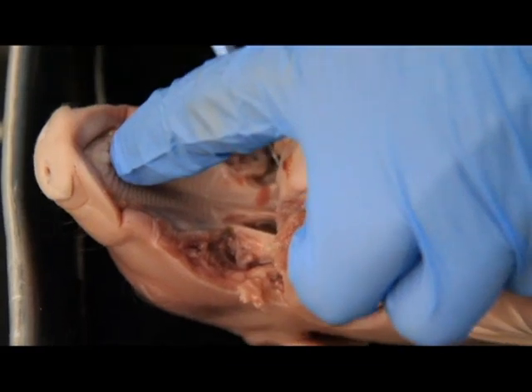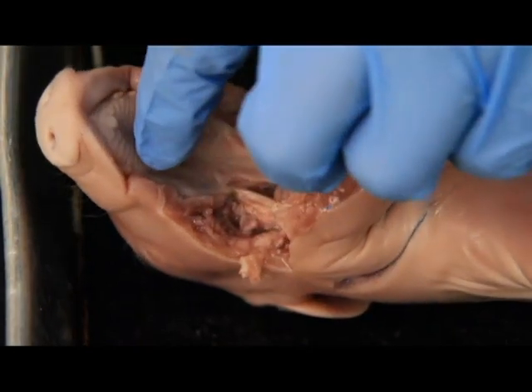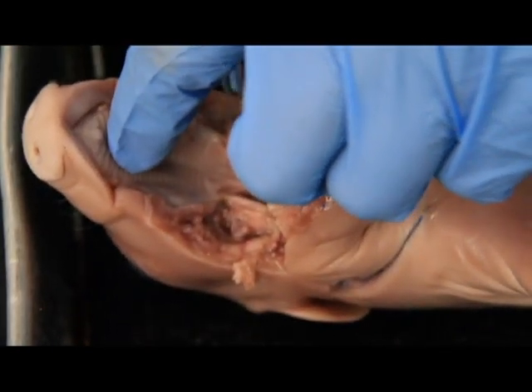And you want to keep pulling this back, nice and wide, nice and wide. It's okay if you see a little bit of food in here. Don't worry about that.